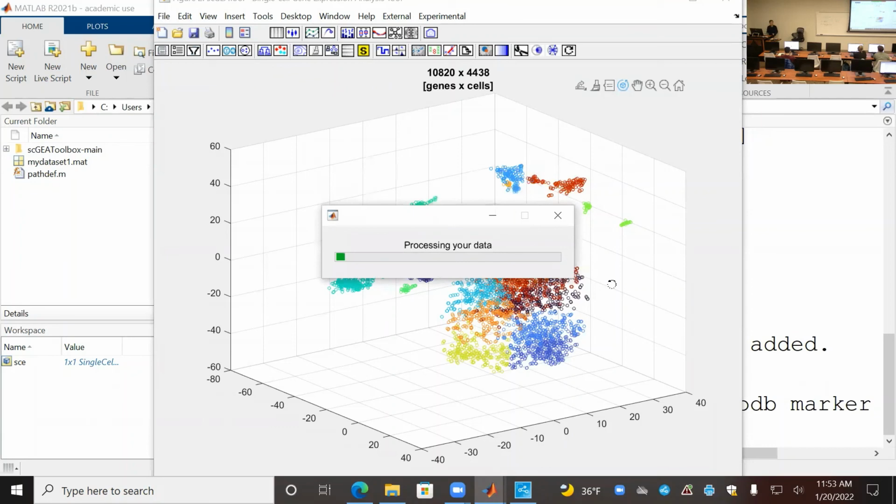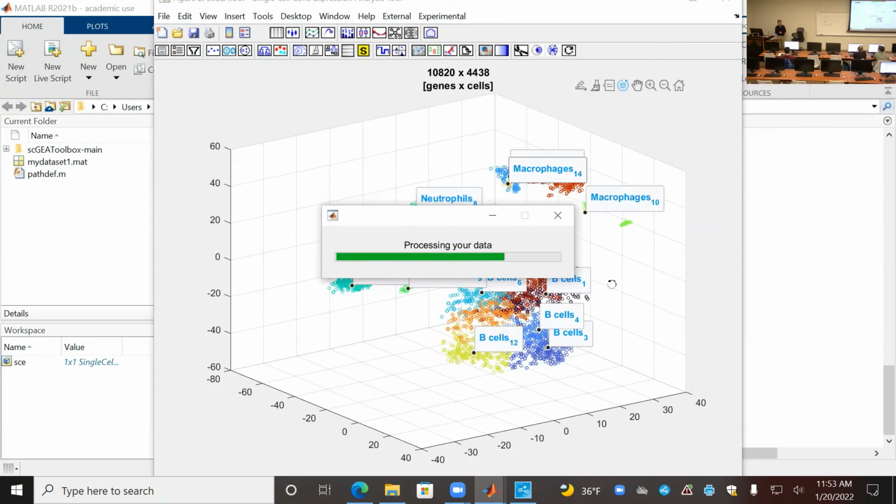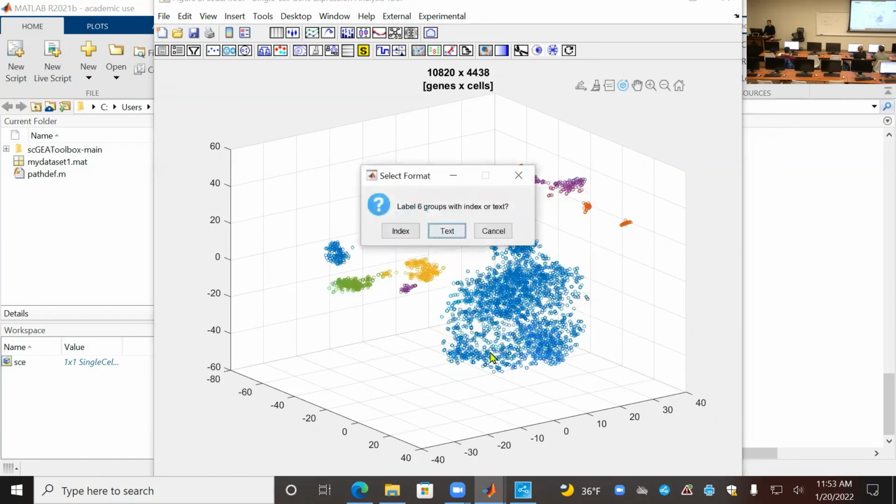Okay, that's all. Oh, I want to know how to delete the cells, once you get there, without having to go in manually and select them.